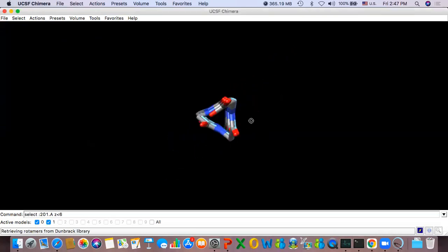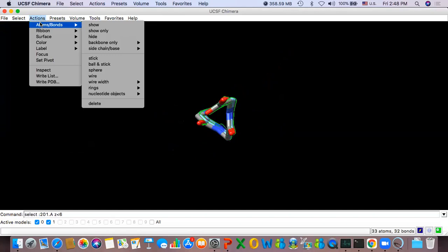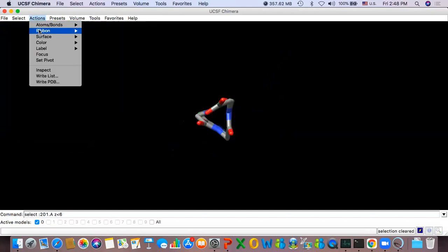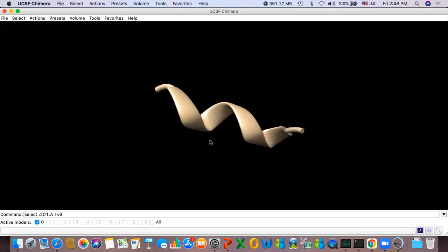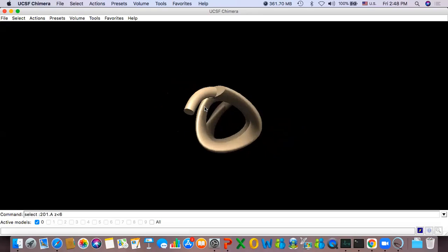So now this is how the 3-10 helix looks. If you look at a top view, you can see that it's a very tightly packed structure. If you generate the same thing for alpha helix, same thing for pi helix, you should be able to appreciate the difference. Let me show everyone. That's how the 3-10 helix looks. So tightly packed interior for the 3-10 helix. It's really twisted in this particular case.